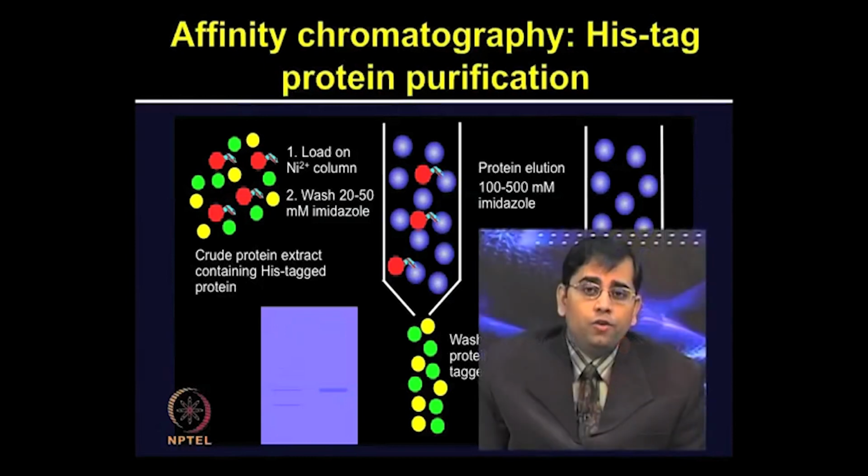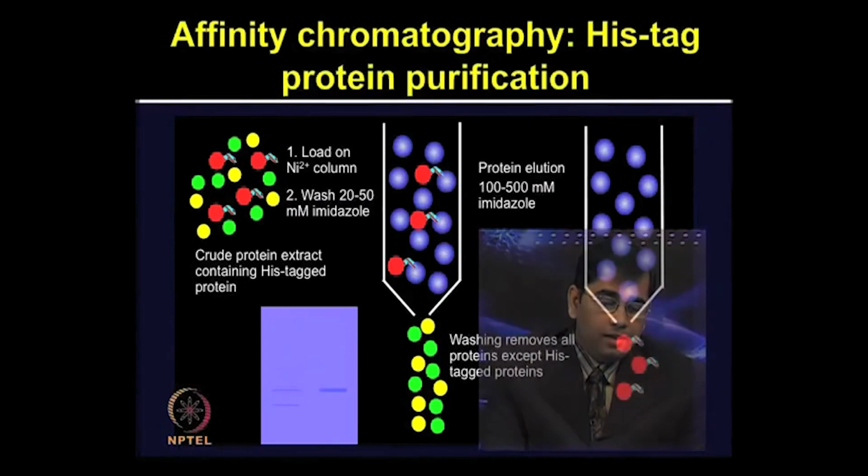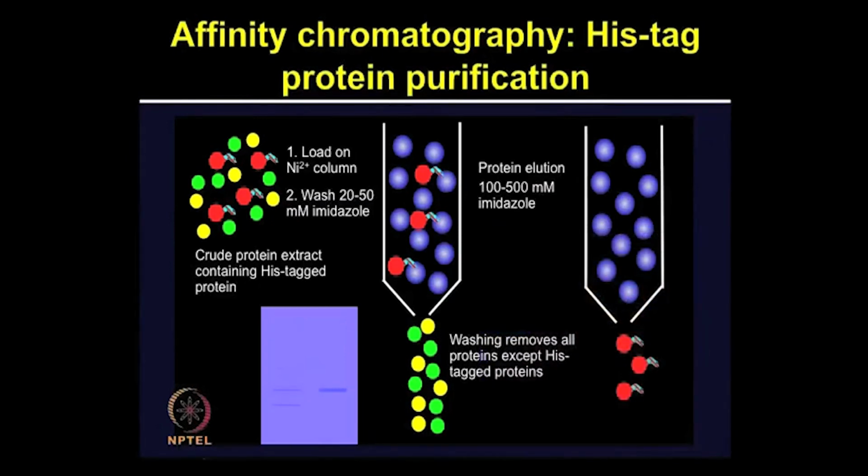The effectiveness of protein purification should be further assessed on SDS-PAGE gel, where one needs to see whether one pure band is shown or even some contaminating bands are also seen. One case is shown on the left side where contaminating bands are seen, whereas in the other case only a pure band can be seen.